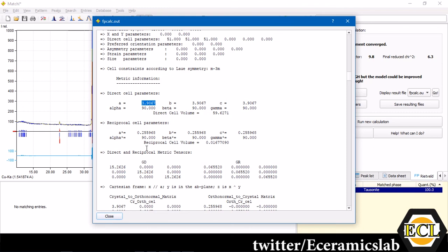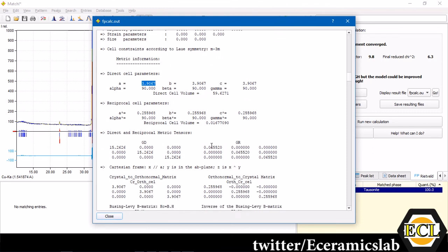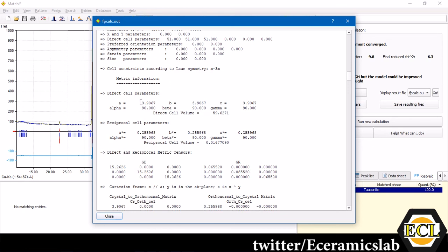Here, through automatic Rietveld refinement, we have quickly found out the lattice parameter.